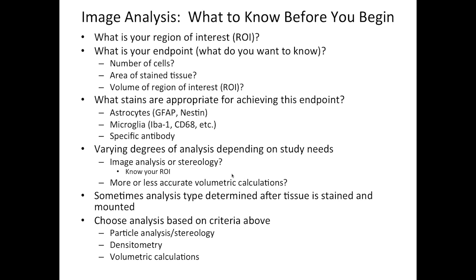So if you call someone up and say, hey, I want to count all of the cells in the brain using a Nissl stain, and I want to use stereology, they'll probably give you a weird look and tell you that it's going to take a really long time and a lot of money. So being able to fine-tune your study to what you need within a region of interest is really going to help accelerate the image analysis process.